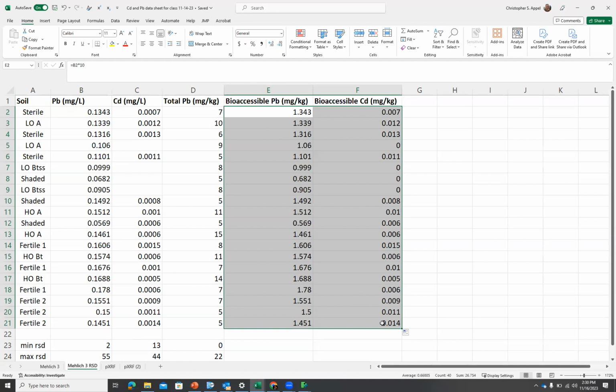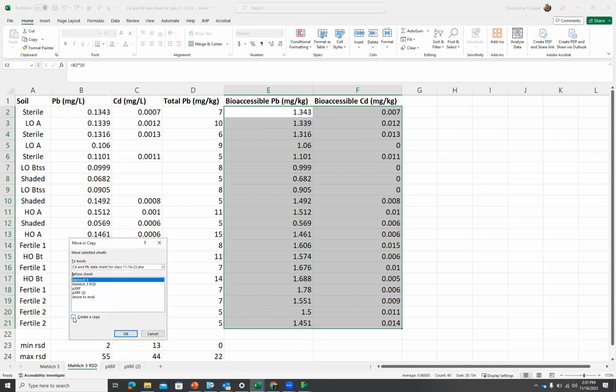All right, you good? So now what I'm going to do is create yet another spreadsheet. I'm going to take this one and copy it. You call it whatever you want, and put it wherever you want.